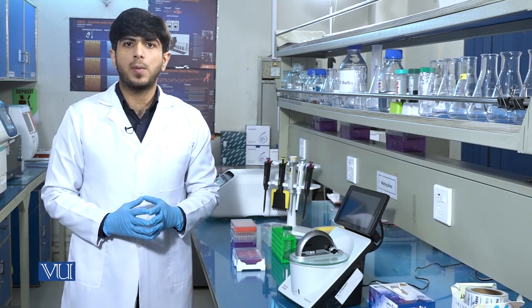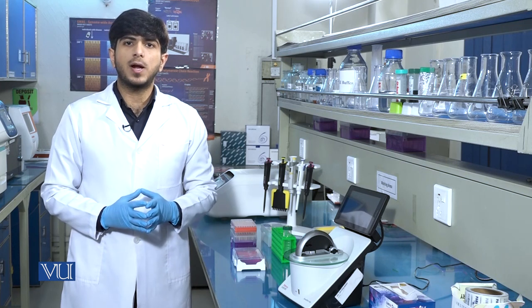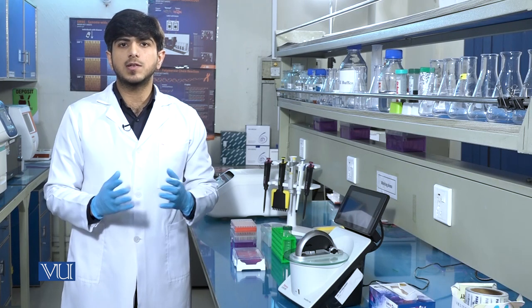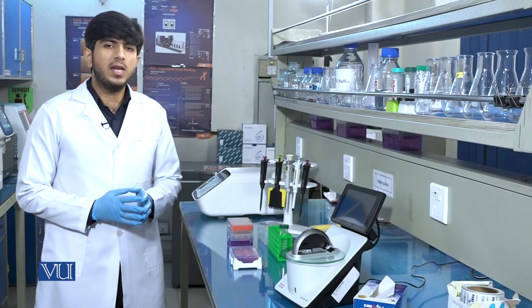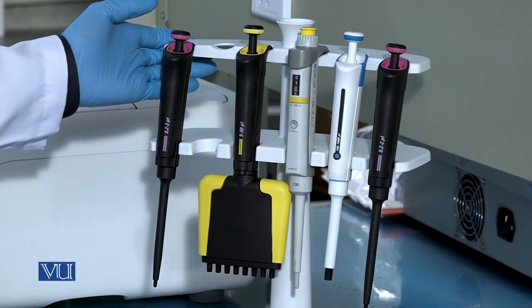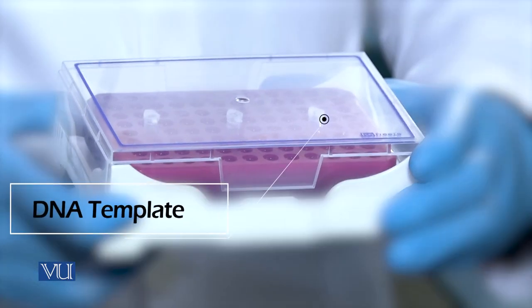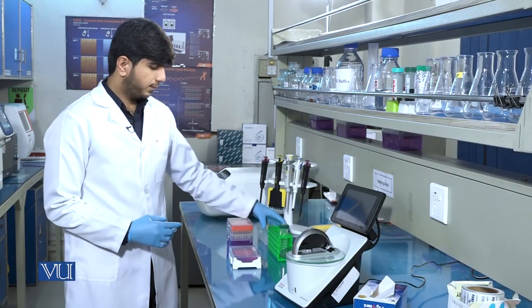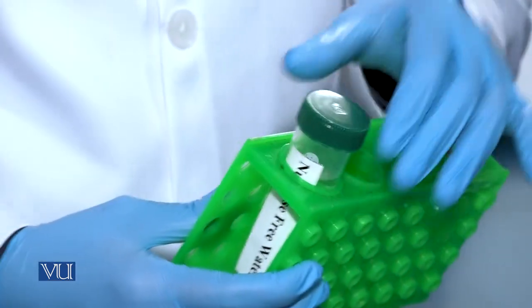UV visible spectrophotometer. Basically, Nanodrop works on the principle of spectrophotometry, which is that absorbance is directly proportional to the concentration and path length. So to quantify the DNA in a sample, we need pipettes, pipette tips, DNA sample, blank sample, which is nuclease-free water.